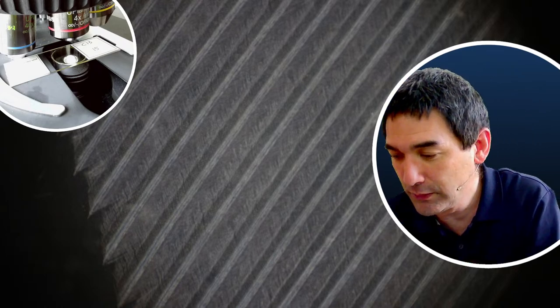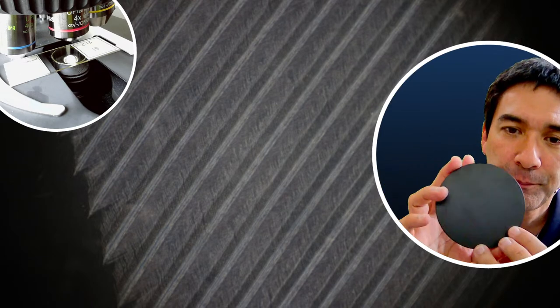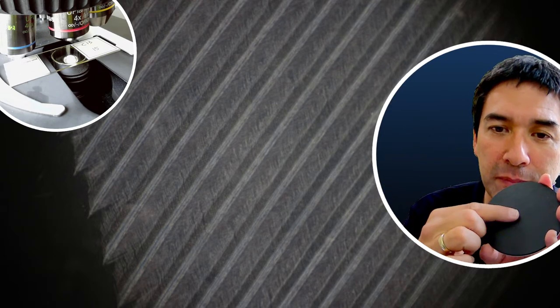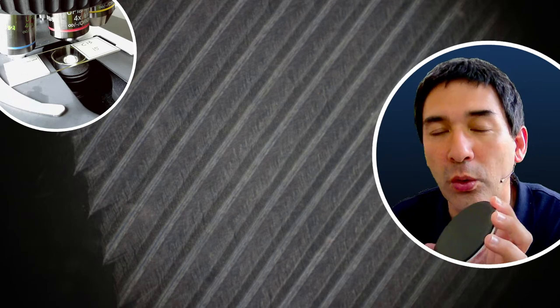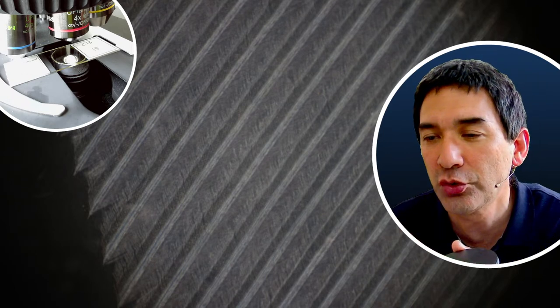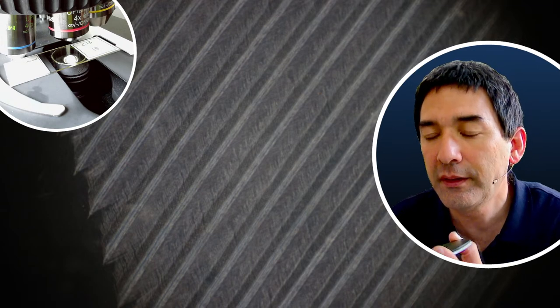The dark background on the stereoscope actually turns purple. I think the reason it looks purple is because the plastic is not completely smooth, and depending on the plastic, it reflects the light differently. It could also be a little bit of chromatic aberration. The main difference between the compound and stereo microscope is that the compound microscope's objective is closer to the specimen, so you have higher resolution — that's the main difference.